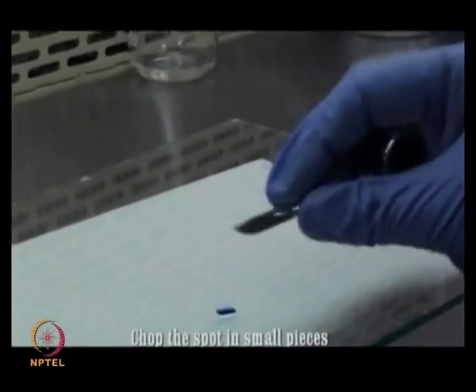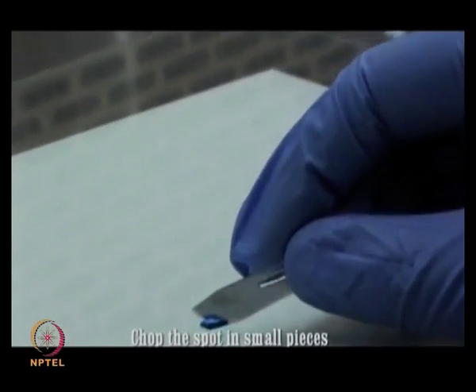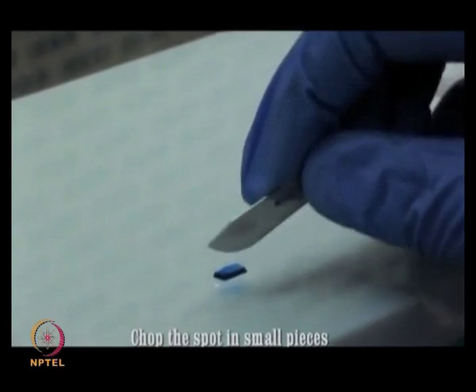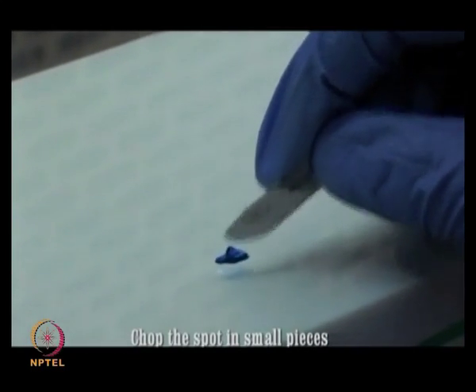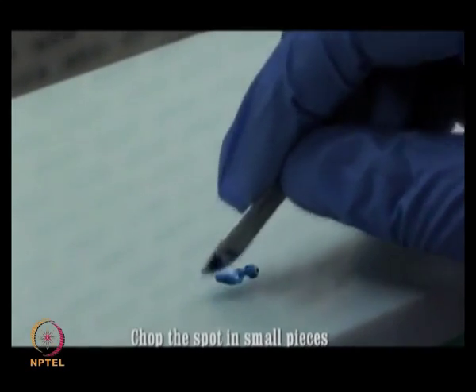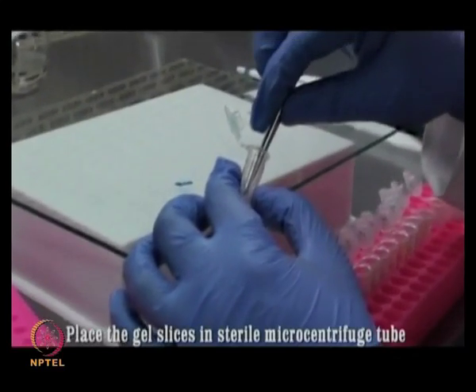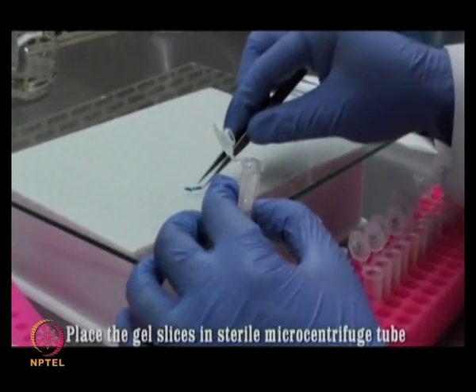So, this is the larger spot. You cannot directly take this one for doing the in-gel digestion. So, you need to excise that into small cubes. Now, keep these small gel pieces into a sterile microcentrifuge tube.